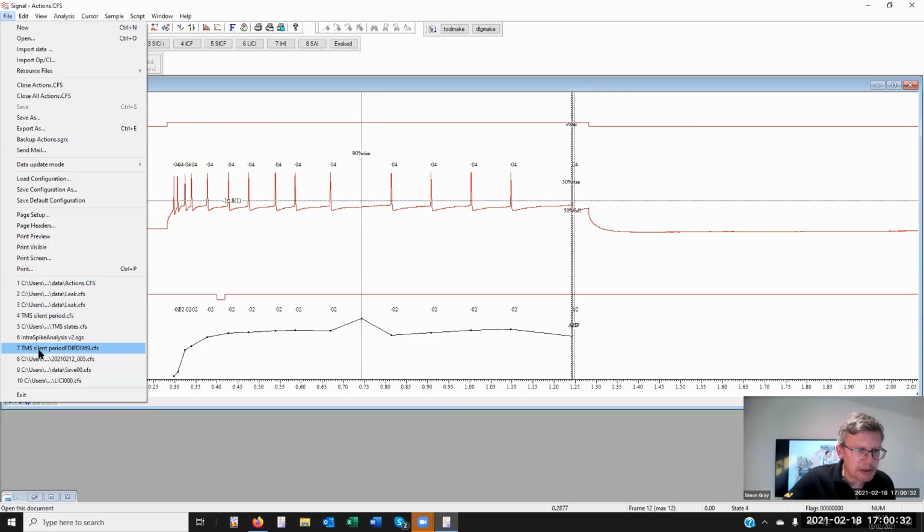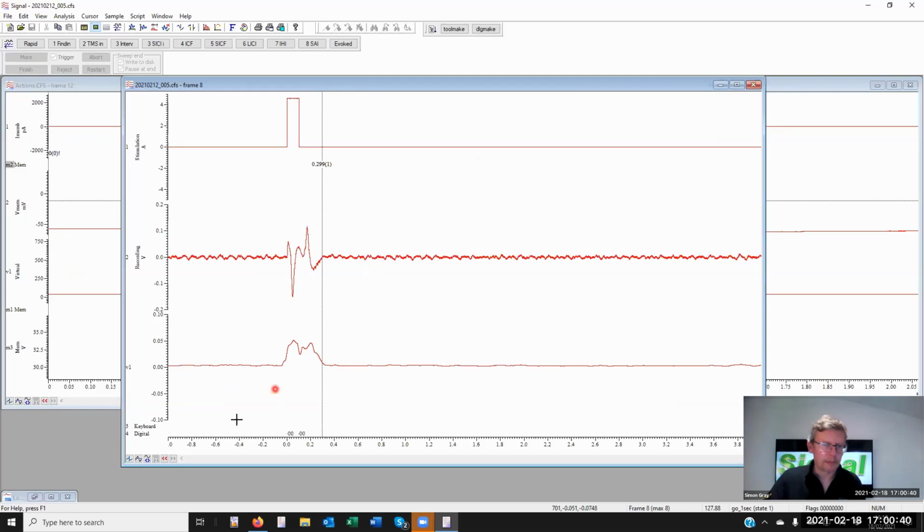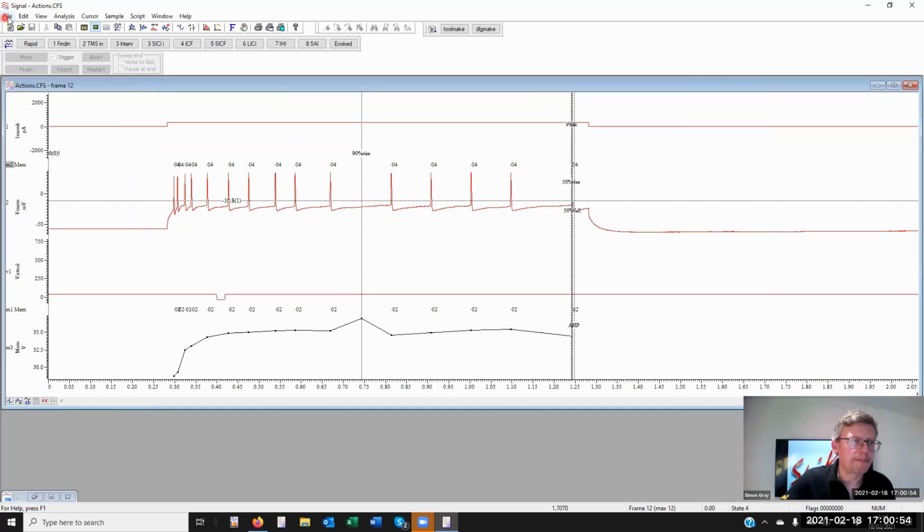What I'd like now to show you is some data that was sent to me just the other day. Yes, here it is. Now we could do some analysis there, but they did indicate that somewhere in their file they had changed filtering characteristics.